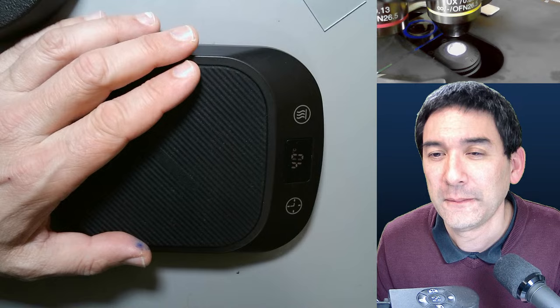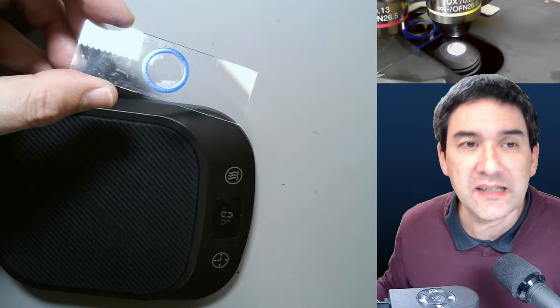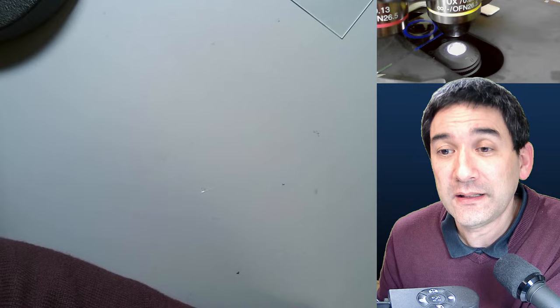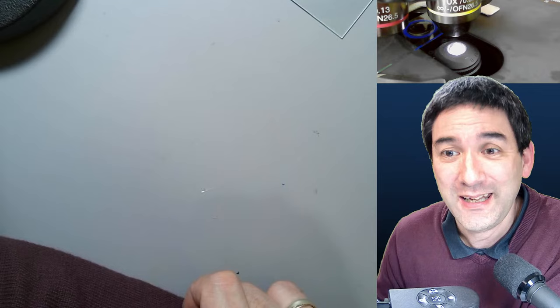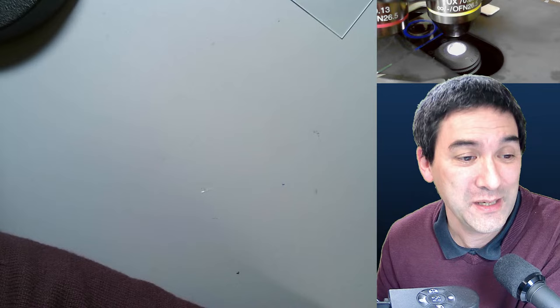Are you able to make permanent slides out of crystal slides? Yes, as a matter of fact I want to do that later — I'd like to try putting a cover glass on using the slide ringing table. But first, because I've been talking for a while, I want to show you a couple of projects that some of my viewers have submitted. I'd especially like to thank Adrian Meisenberger, who is also in the chat.